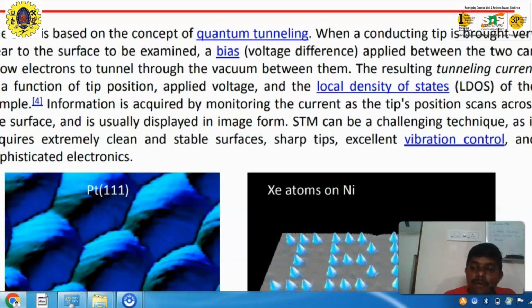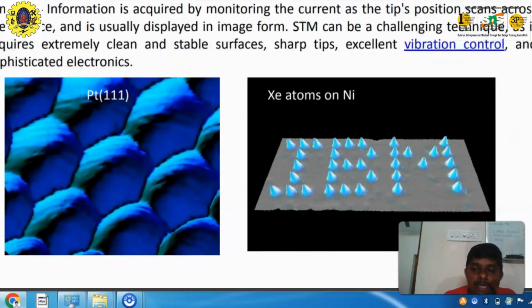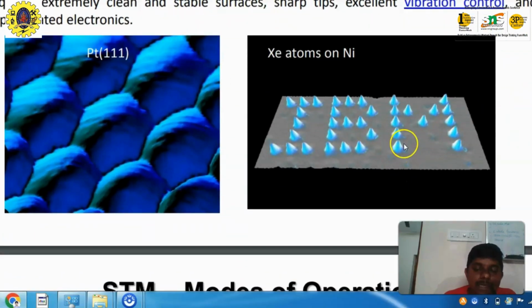So that is why these atoms are studied at the micro level, and here there is a detection by the electronic panel used for this study, and by passing the atoms over the panel it can generate some information.